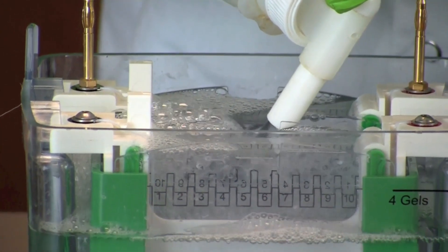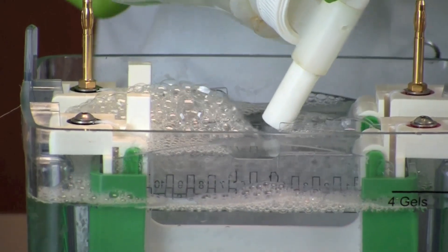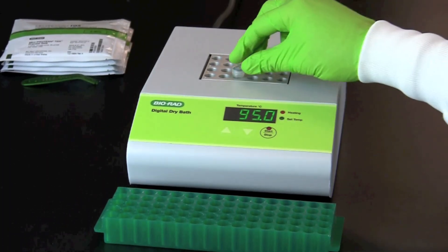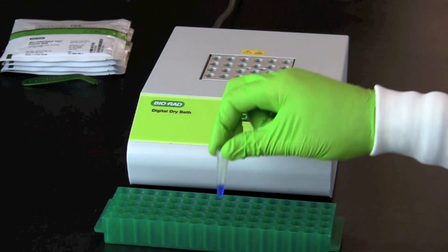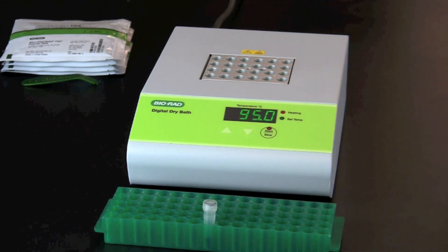The gels are now ready to load. Heat the fish sample and actin and myosin standard to 95 degrees Celsius for 2 to 5 minutes.